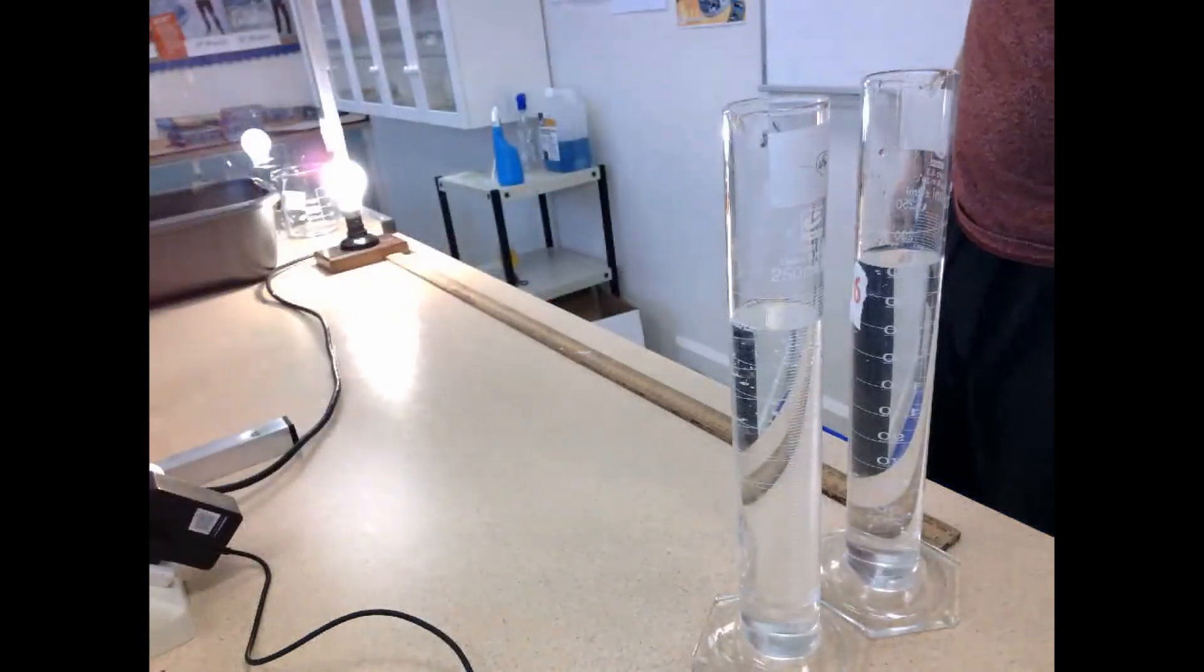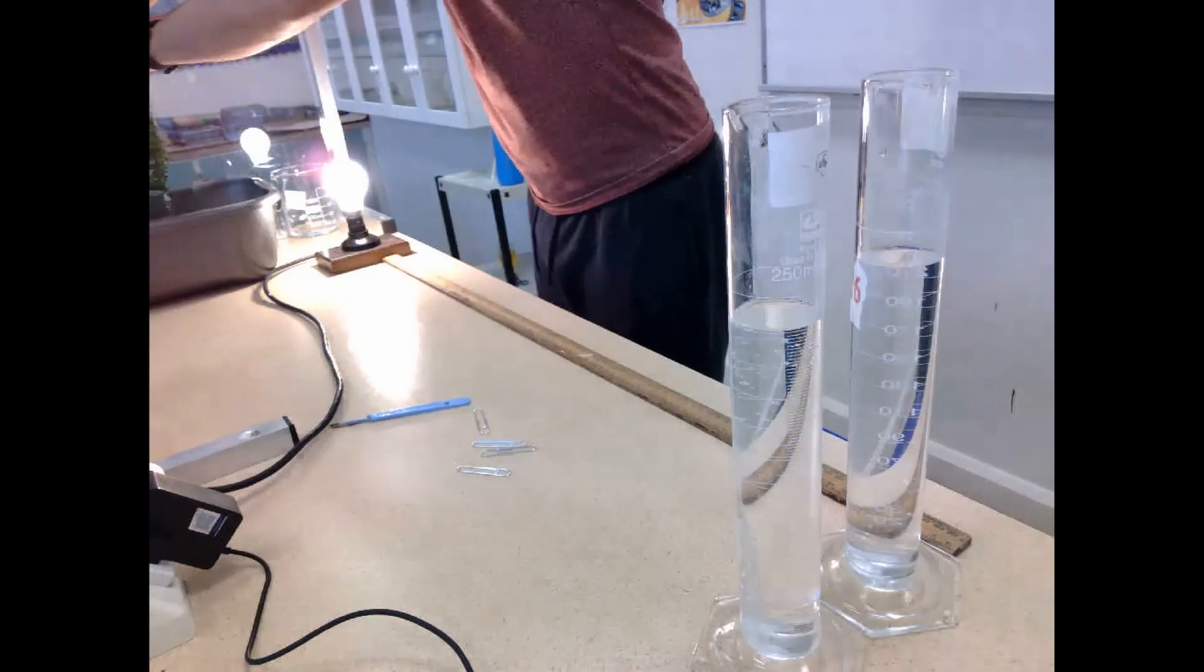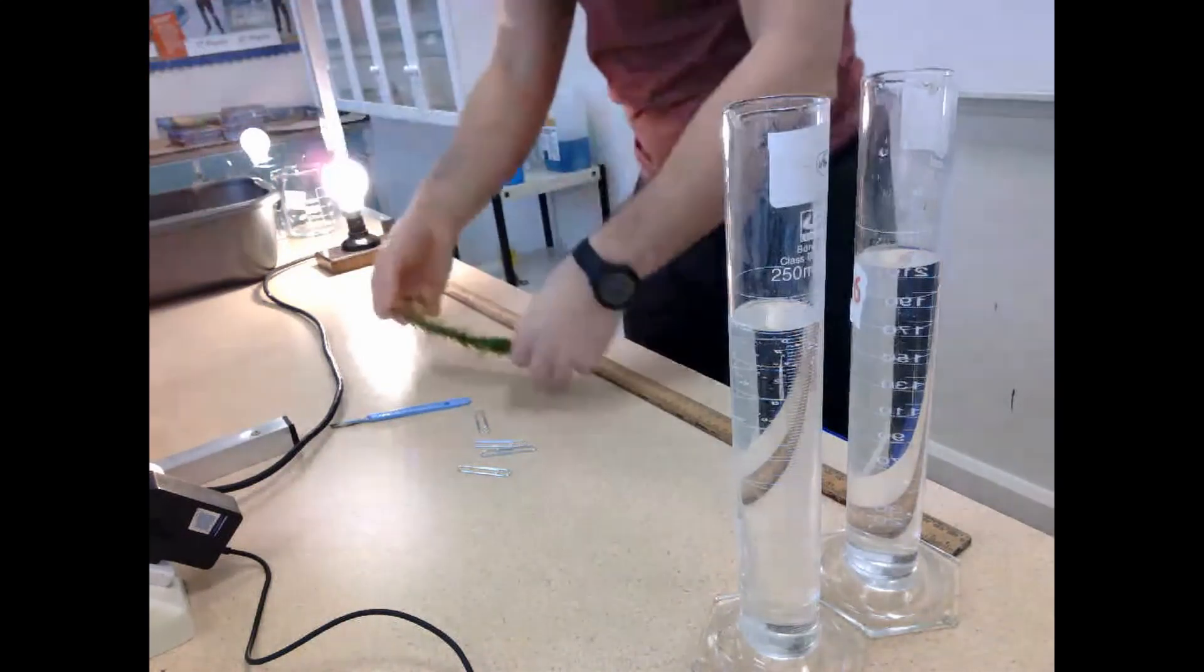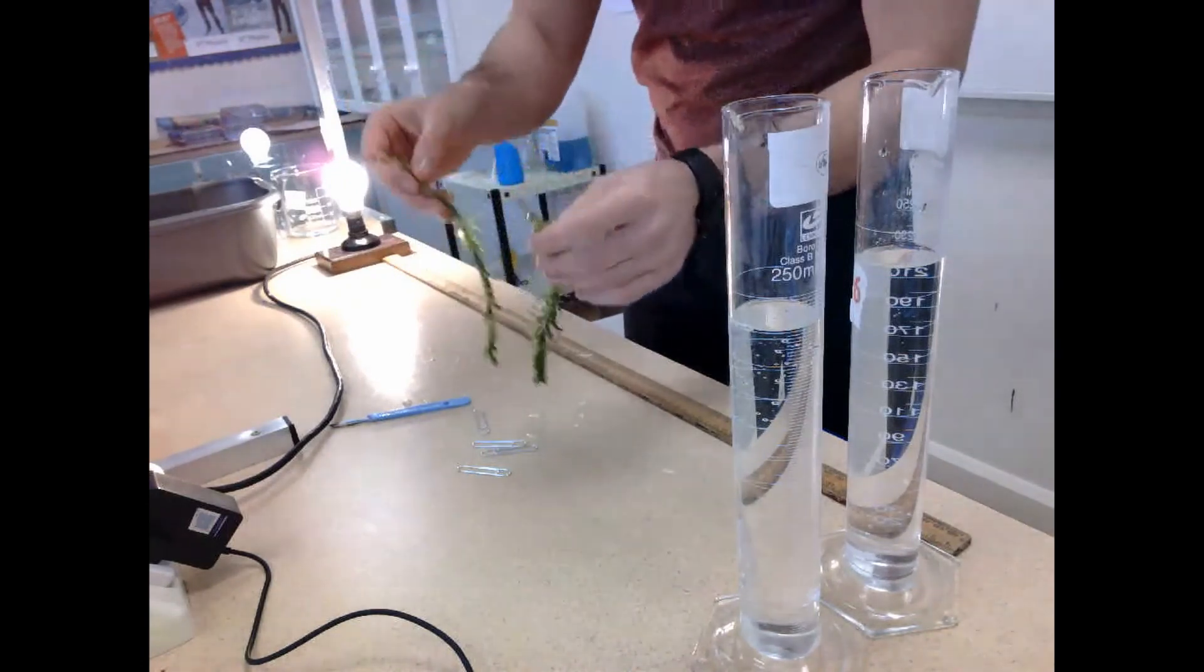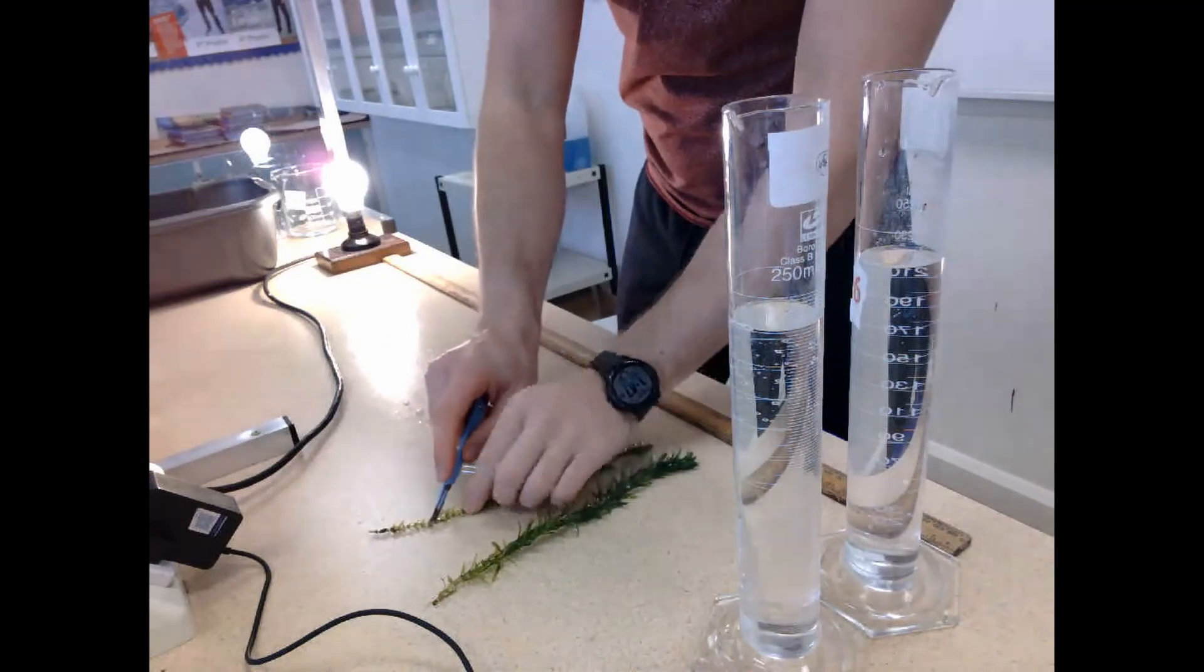So I'm going to take two bunches of elodea and then using my scalpel, I'm going to cut across them at an angle. Now the reason I cut across at an angle here is to cut through an air sac, so that when these elodea are in the graduated cylinder and they begin to photosynthesize, we can see the bubbles being produced.